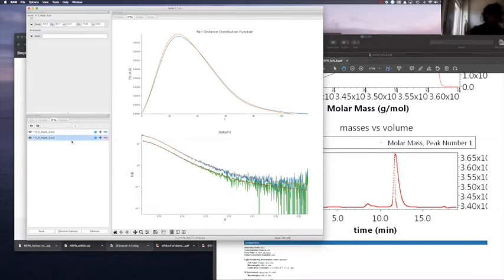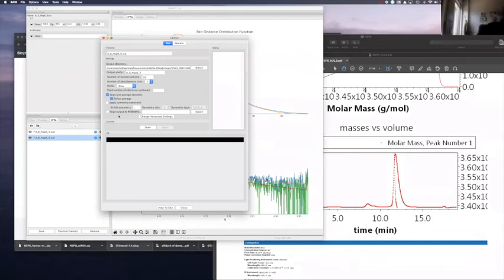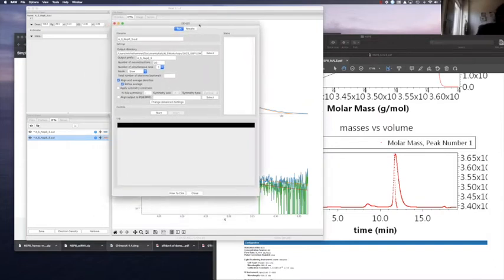Let's decide to take this shoulder, and we're going to save that too, but we don't need to. You can go here or even here. It's called electron density, and again, what I really appreciate is that our speakers show these tools in pretty good detail. Just let me give you an example for this one.